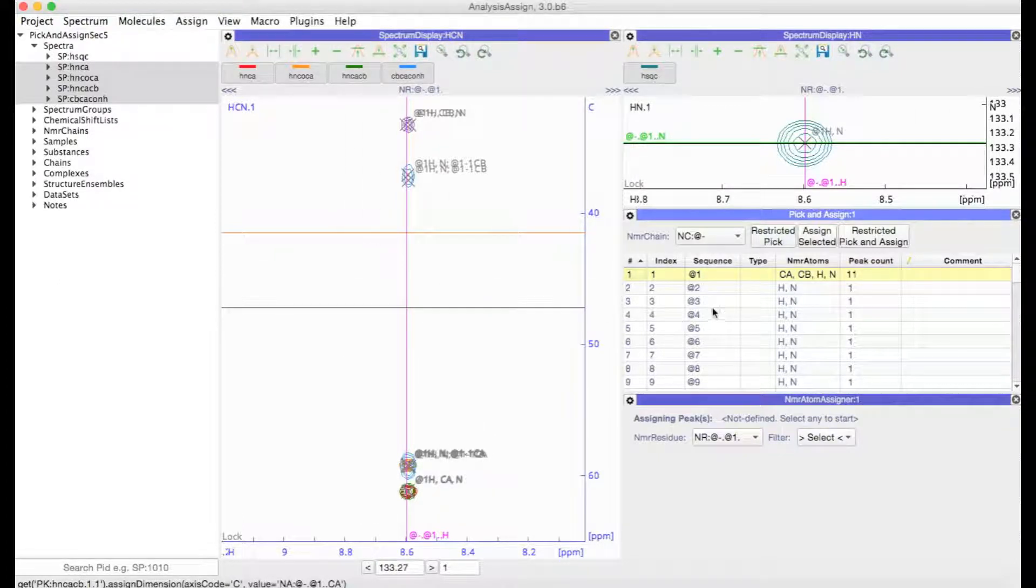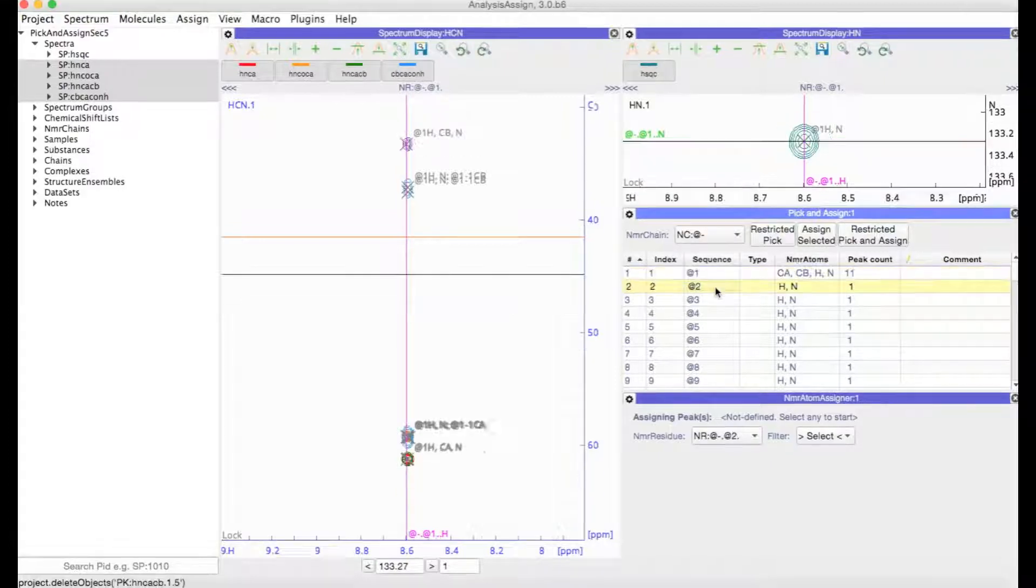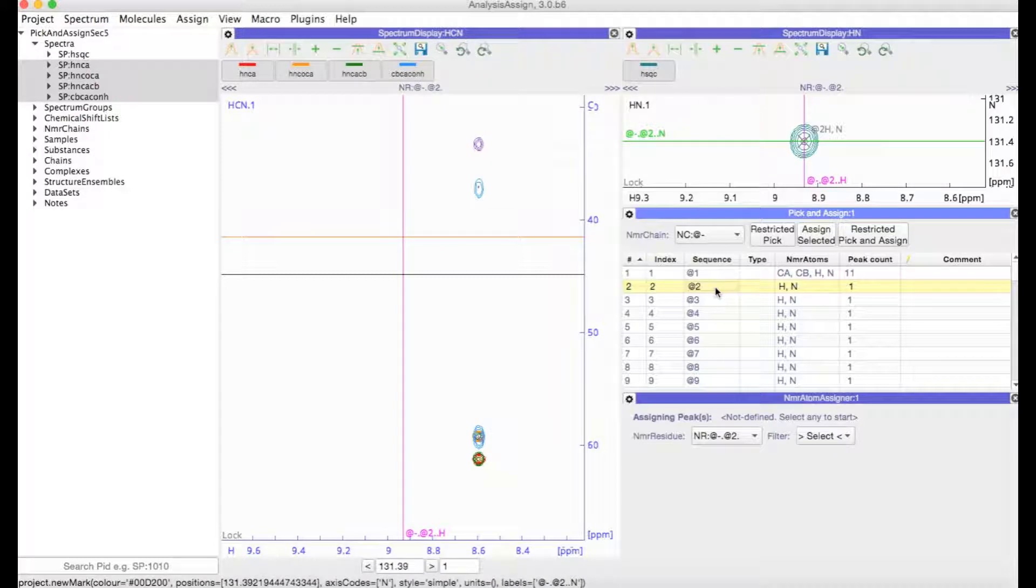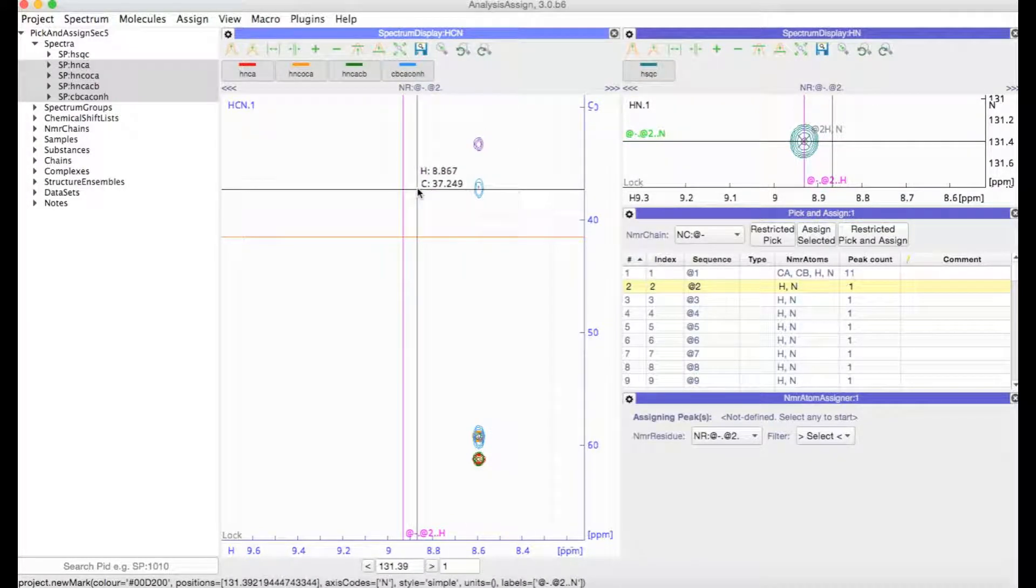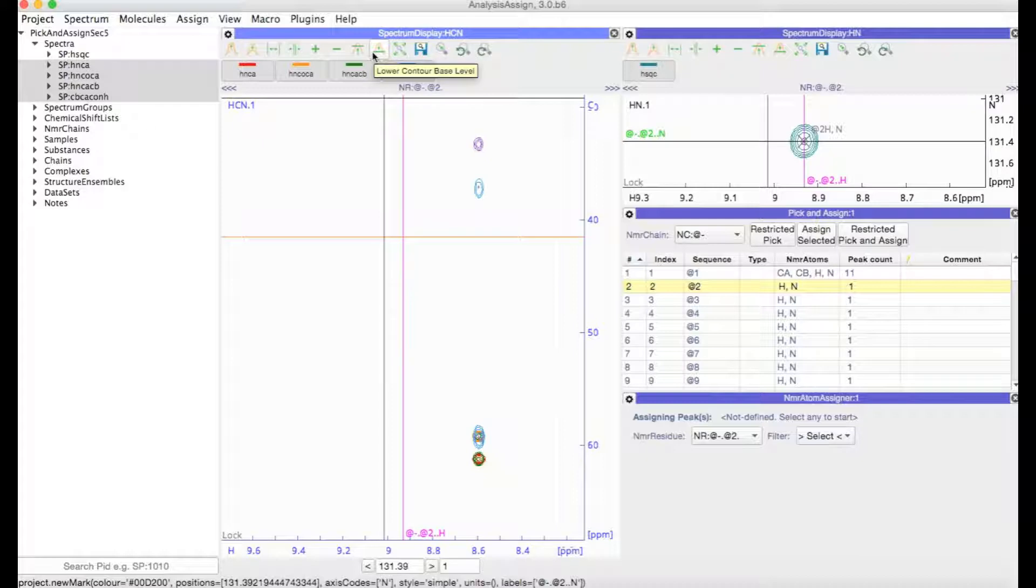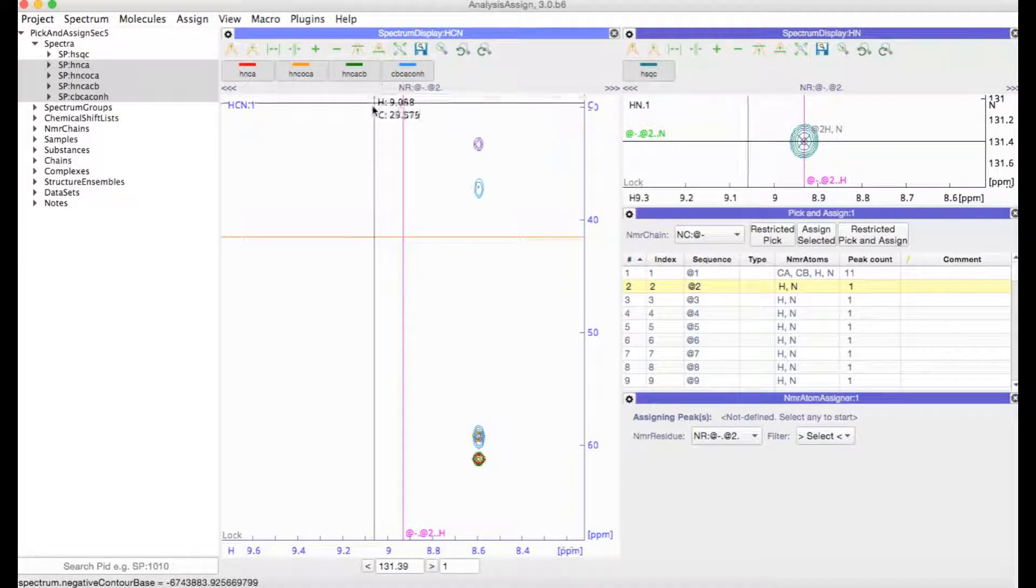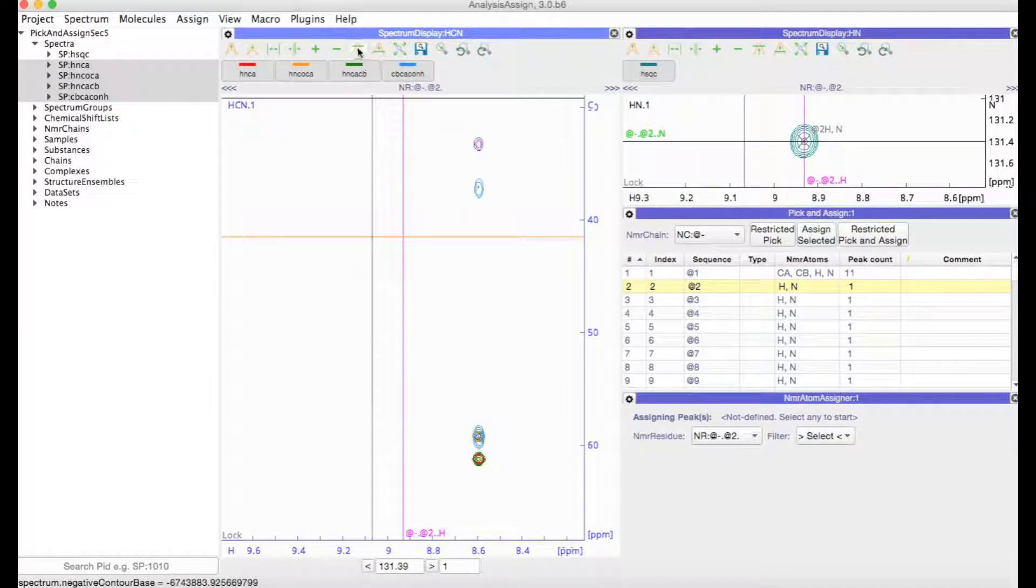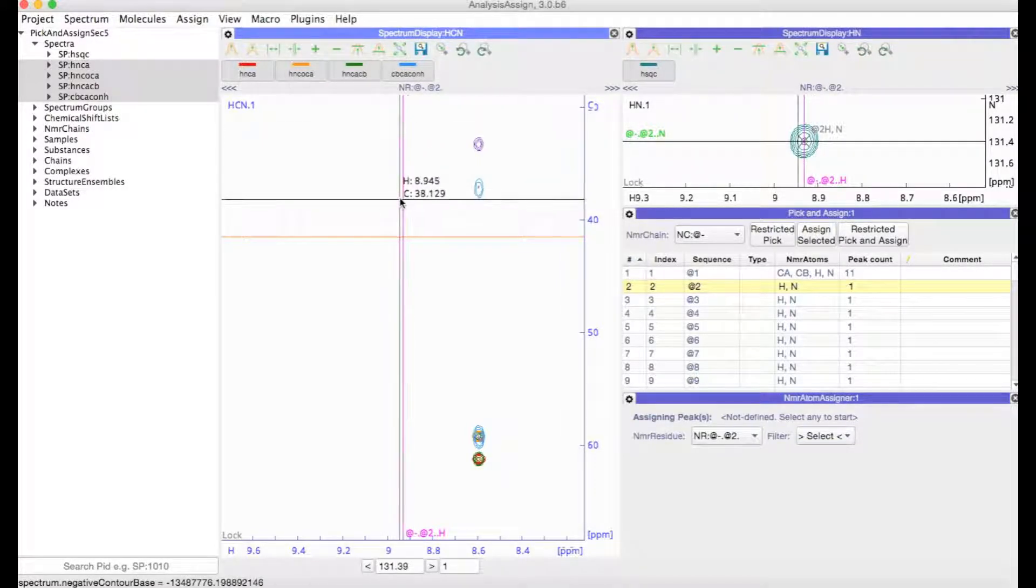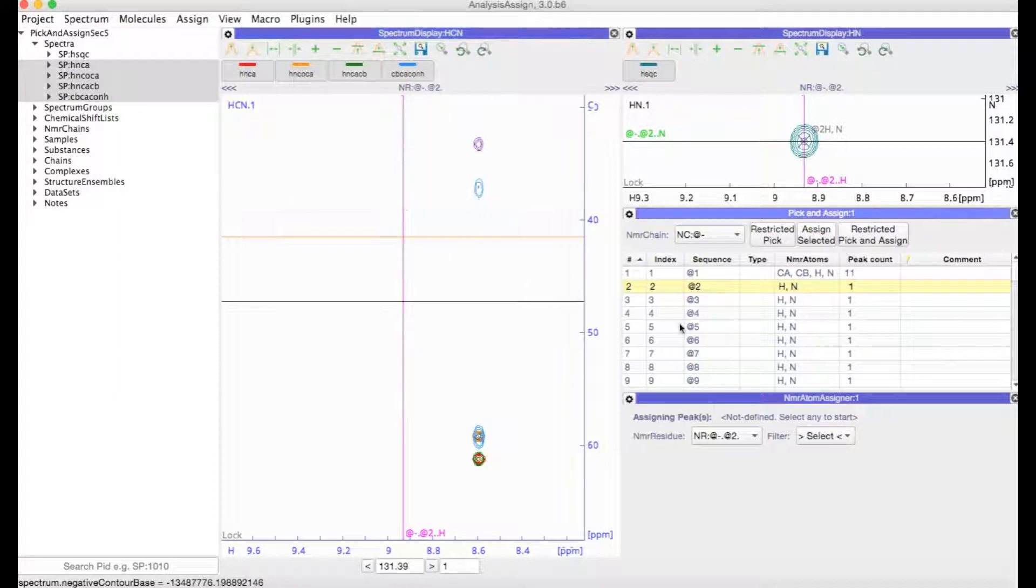So then it's time to move on to the next NMR residue. Simply double click. You can see here there don't seem to be any peaks. It could be worth going down with contour levels just to check that there isn't anything there. In fact, this is a tryptophan side chain, so we wouldn't really expect any peaks in our 3D spectra.